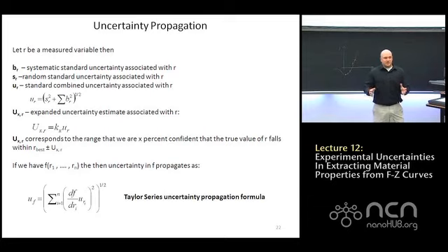If I know capital U for the 95% confidence interval, that means I'm 95% certain that the true value of our measured variable lies within our best guess plus or minus capital U. If your sample size is large enough, that k term is 2 for the 95% confidence interval. If your sample size is smaller, you start dealing with distribution tables.